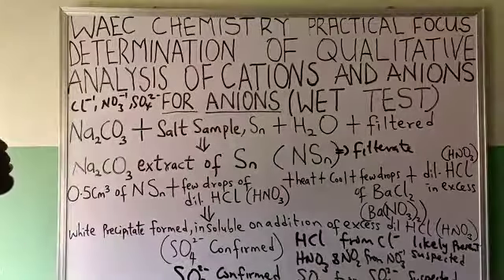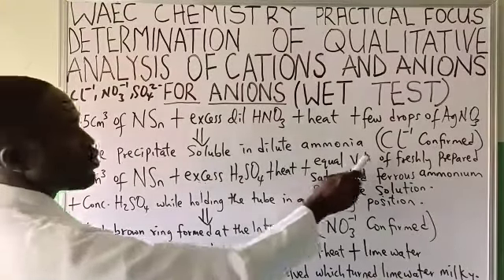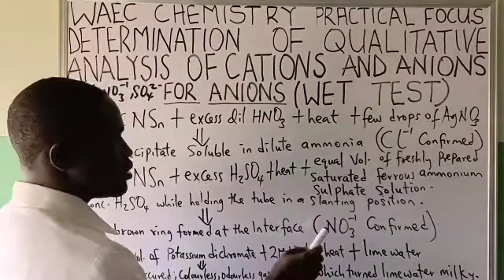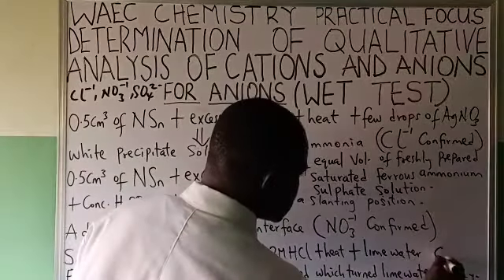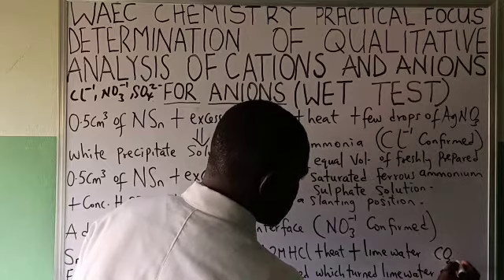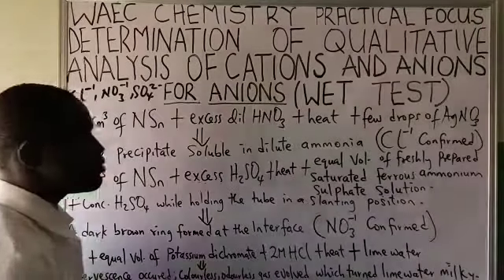Please note it. Okay, now to confirm for chloride ion, nitrate ion, and also carbonate ion, we want to confirm them.